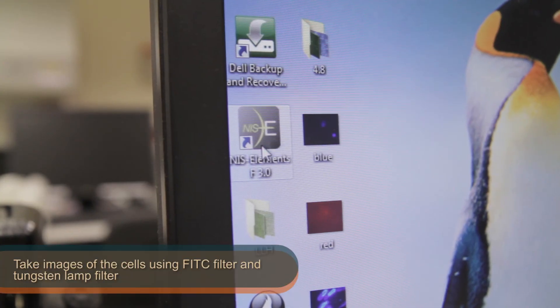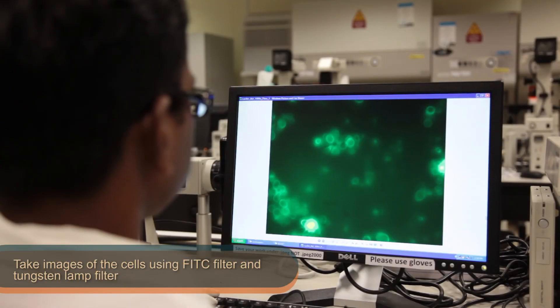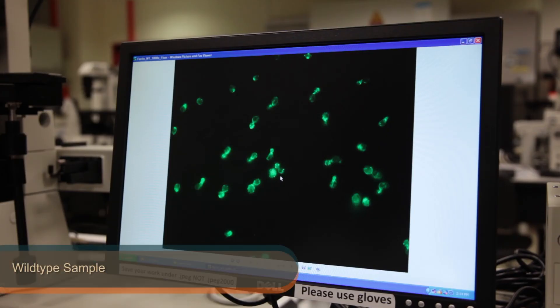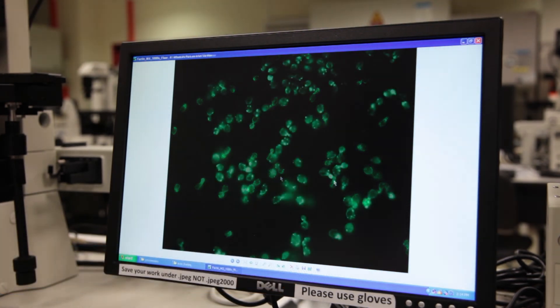Take images of the cells using the FITC filter and with the tungsten lamp filter. These are the images you should be able to see.